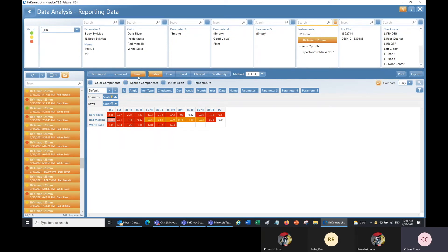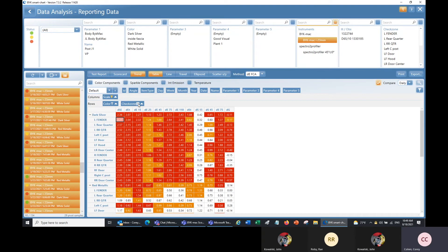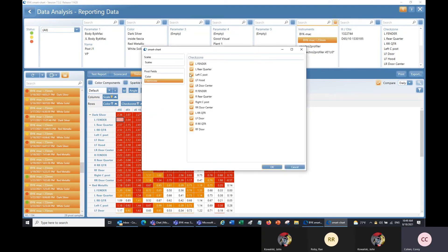Here we are in the trend section. I've filtered my data and selected the test series I want to see. This trend table is a pivot chart just like the scorecard section, with categories in columns and rows. Currently the rows have data separated by color, meaning it averages each value across all check zones and all selected test series for each color. If I'd like to split that data up by check zone, I can drag check zone down here. I can also click to select only the check zones I want to see.